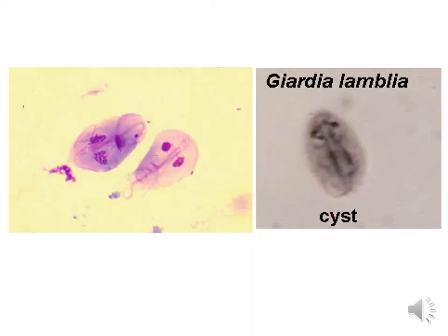Here you see also two forms of Giardia. To your left, there are two specimens. These are trophozoites, the actively feeding stages, which have a concave, cup-shaped structure on the anterior ventral side by which they attach to the intestinal villi. And each trophozoite has two clear nuclei. And of course, with the central axostyle, and 4 pairs of flagella, it gives it the shape of a face. And some people say it is a smiling face, although I don't see any smile here.